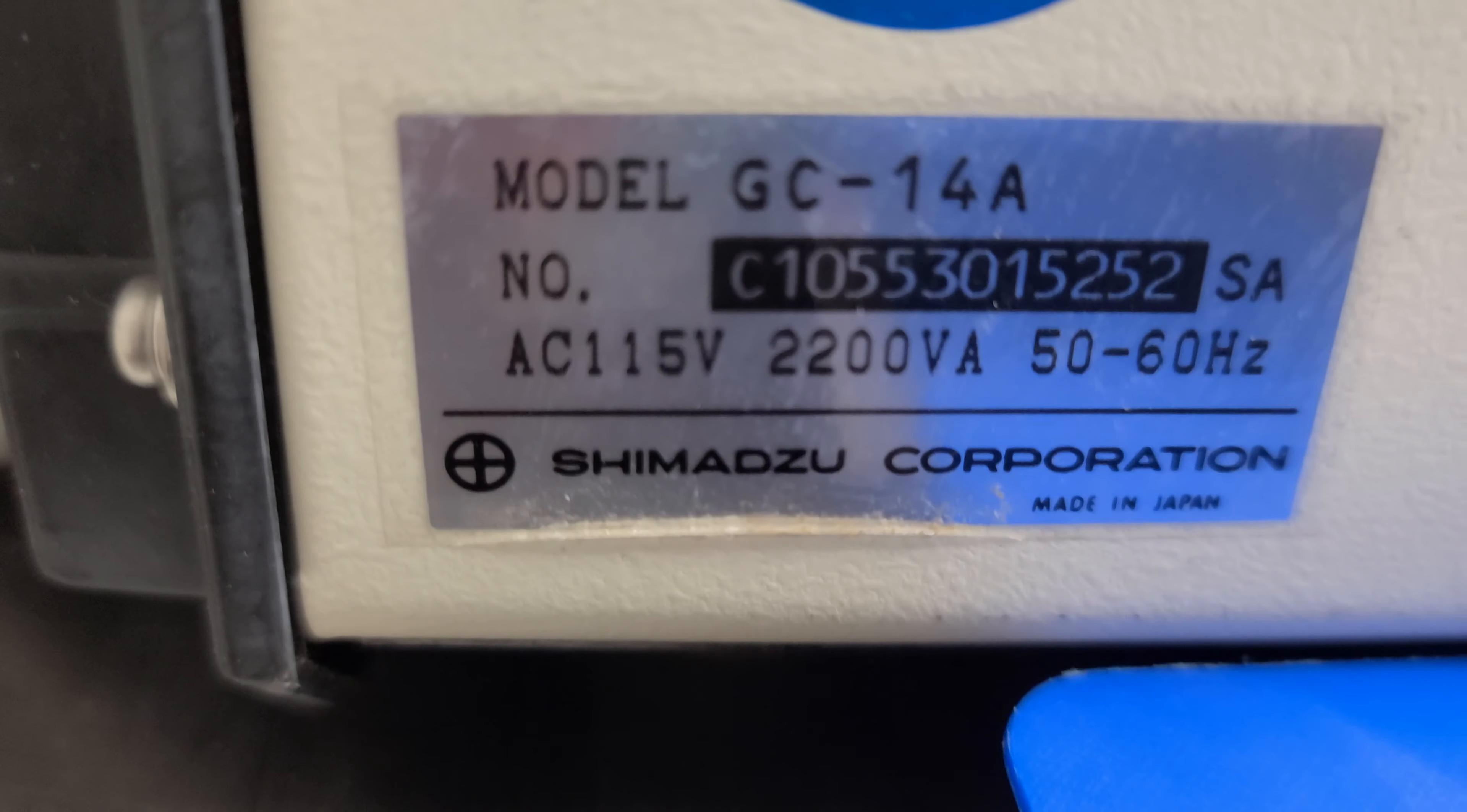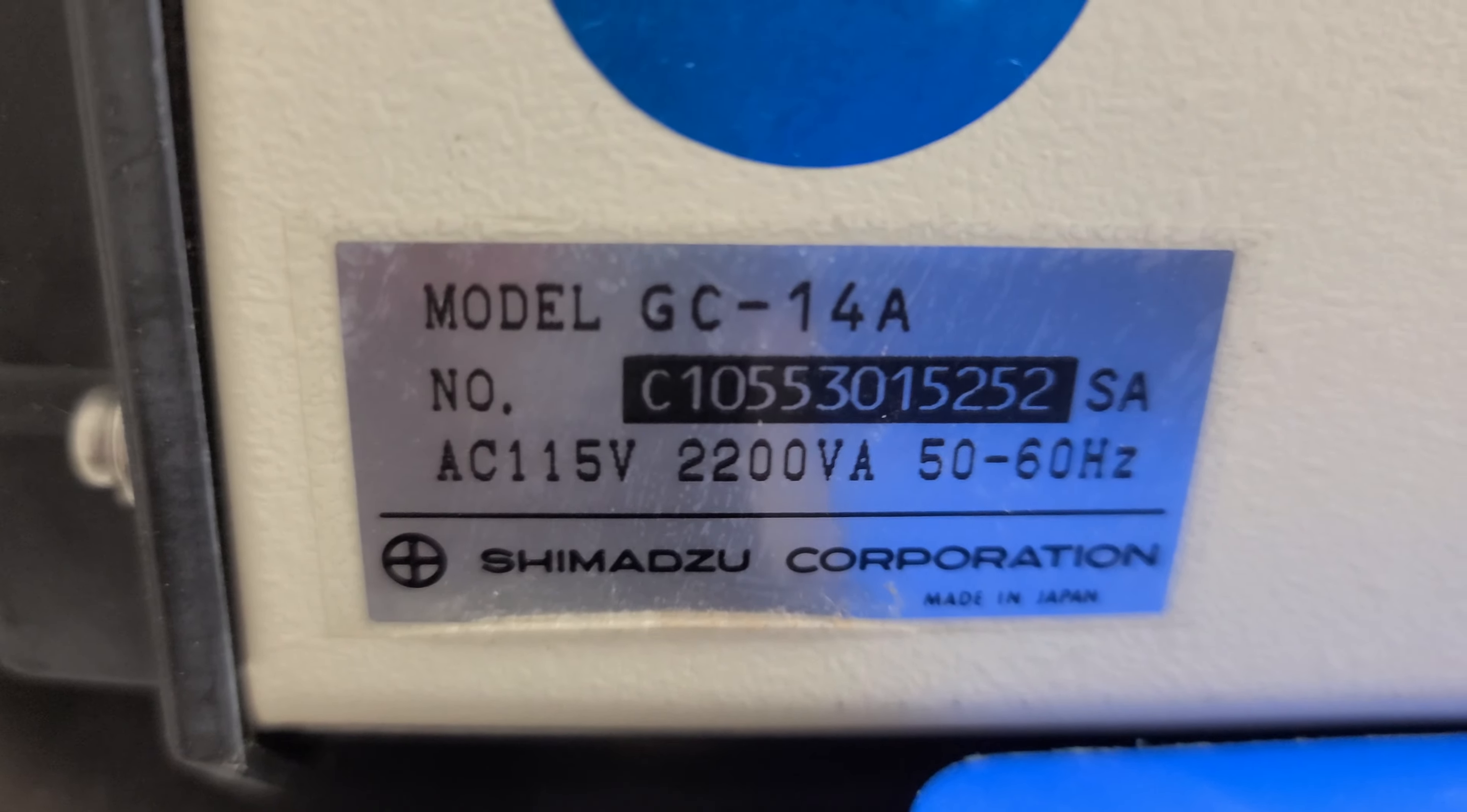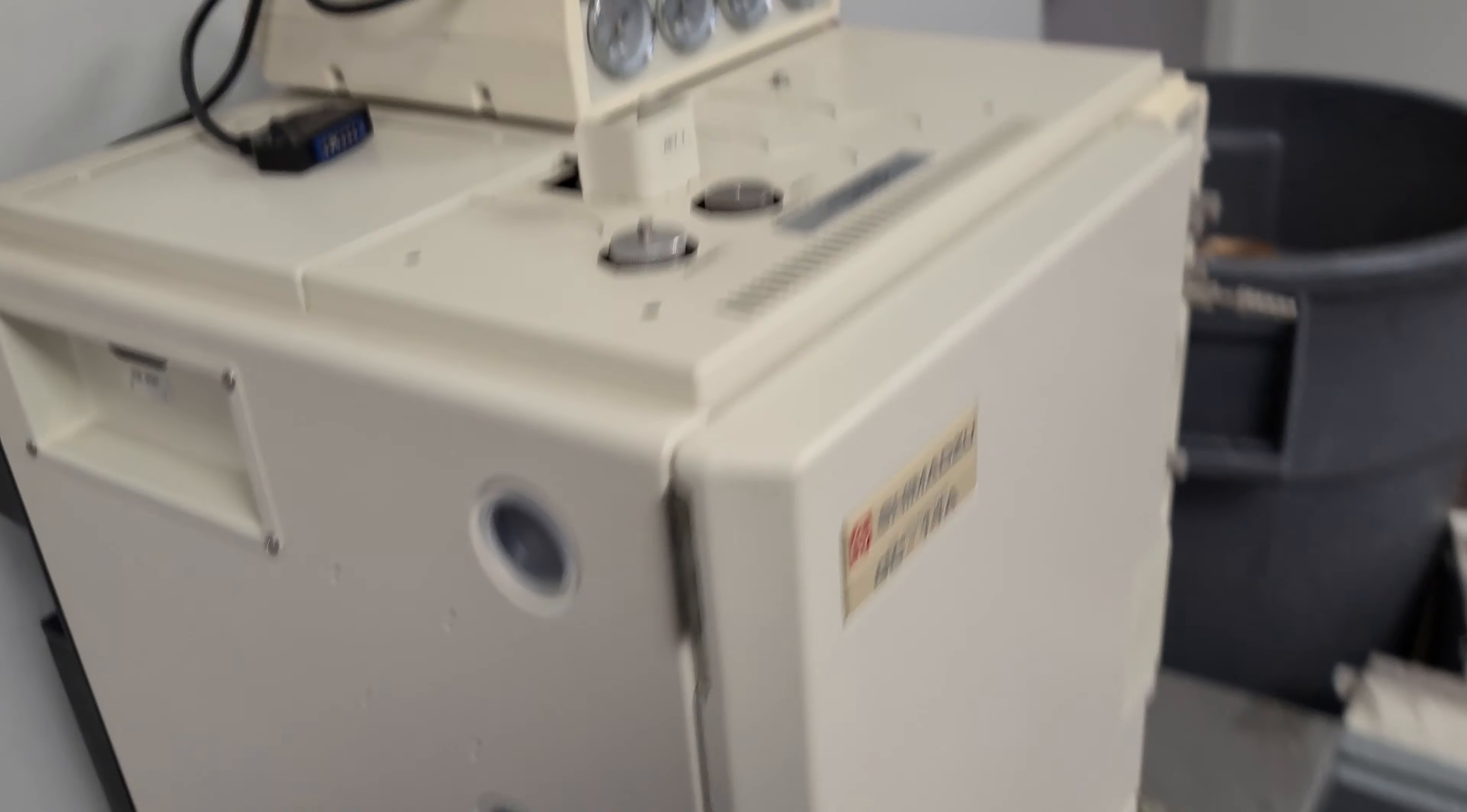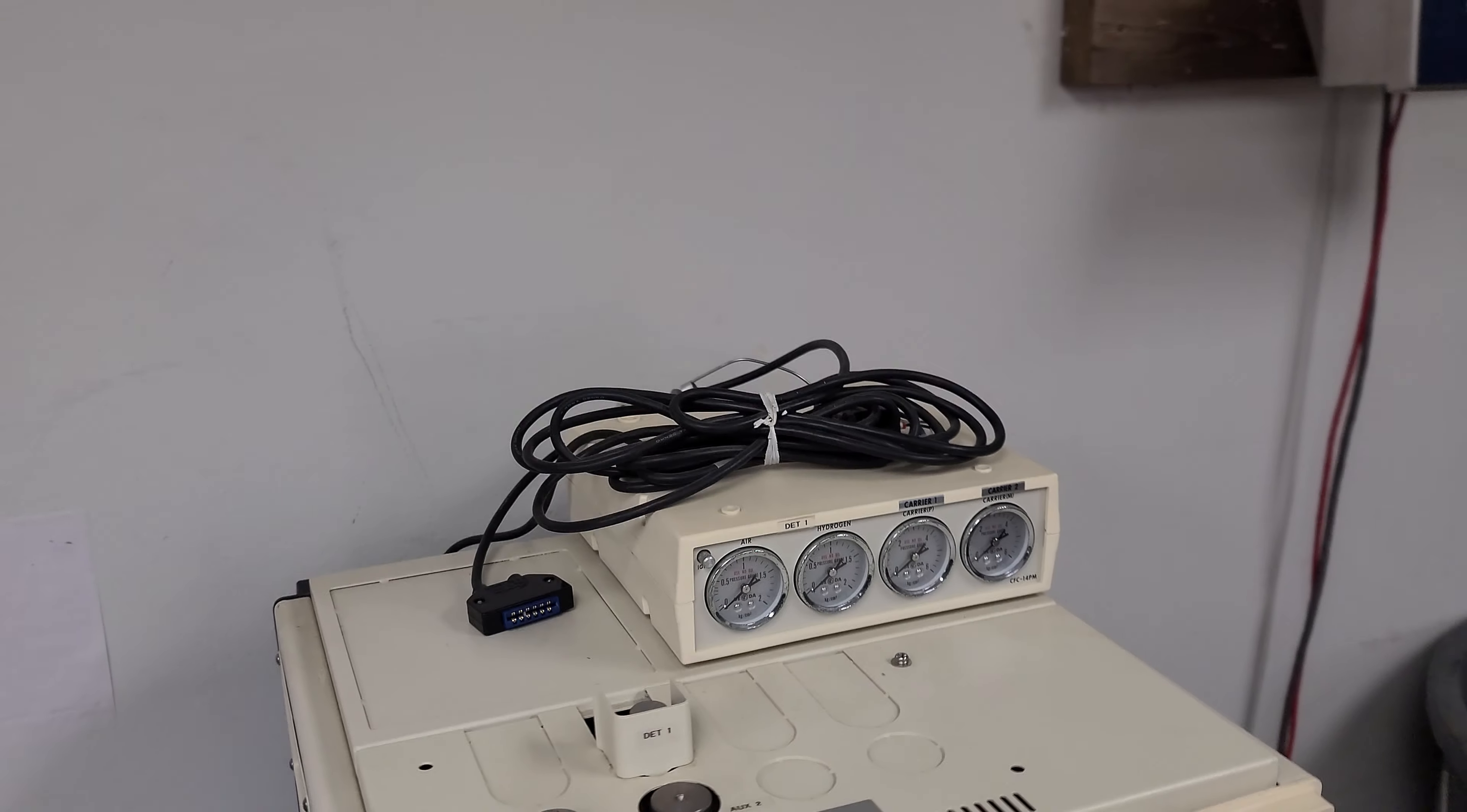Just noticed the tag, let me get you a picture of that. And there it is.